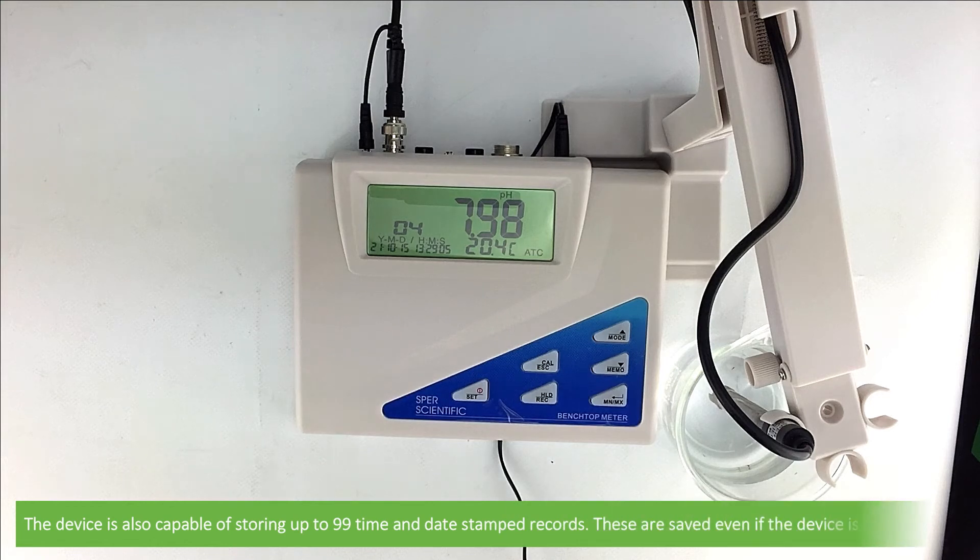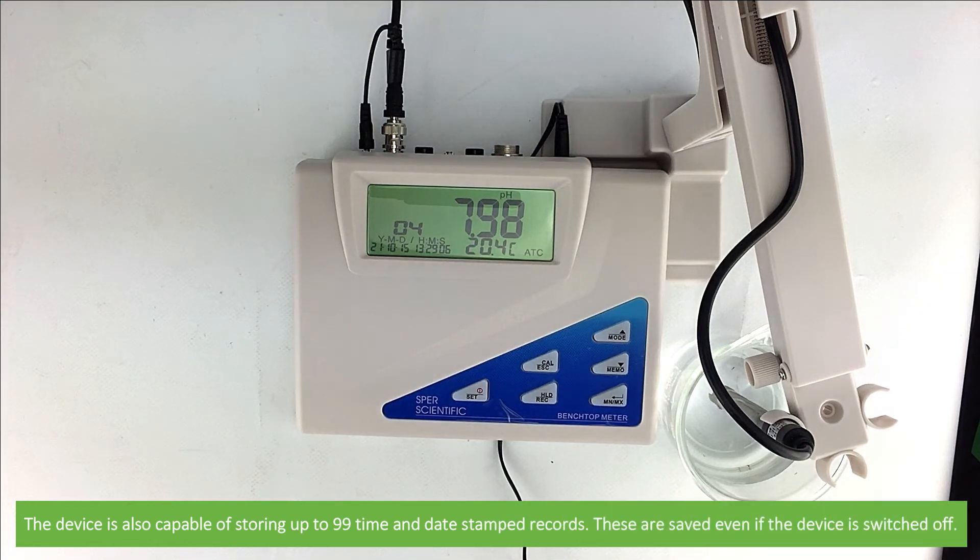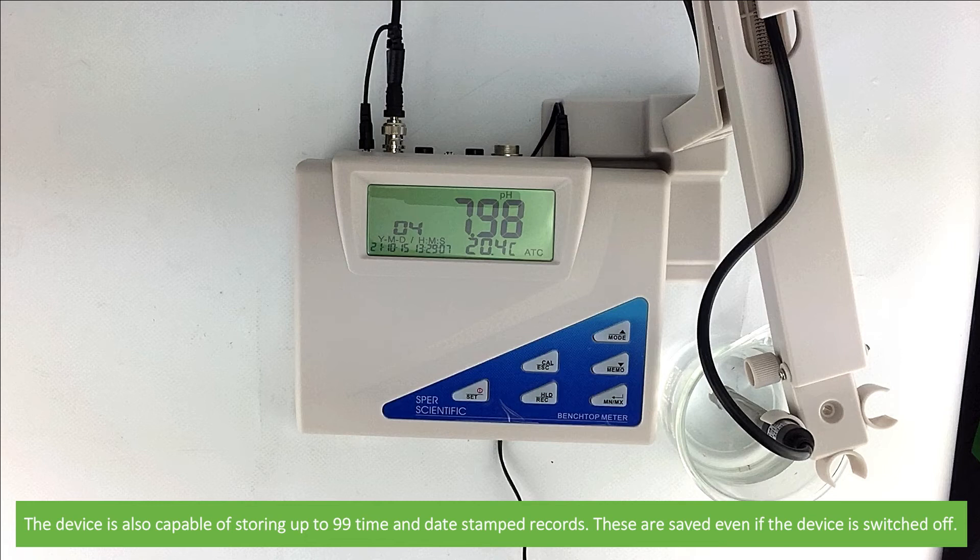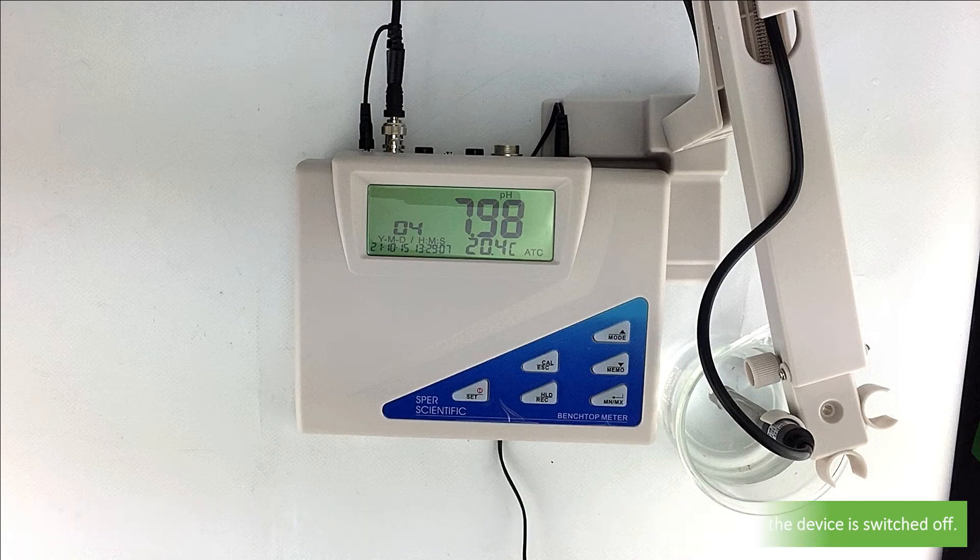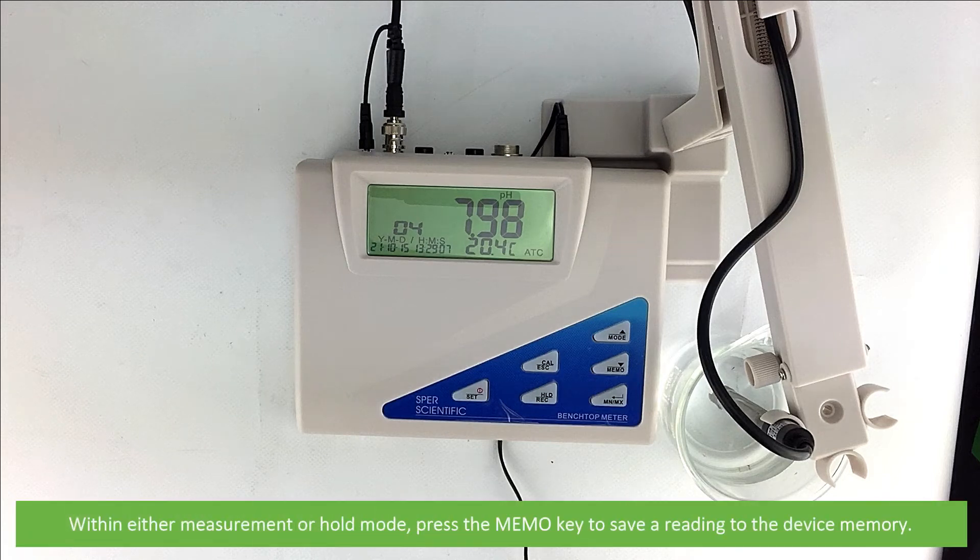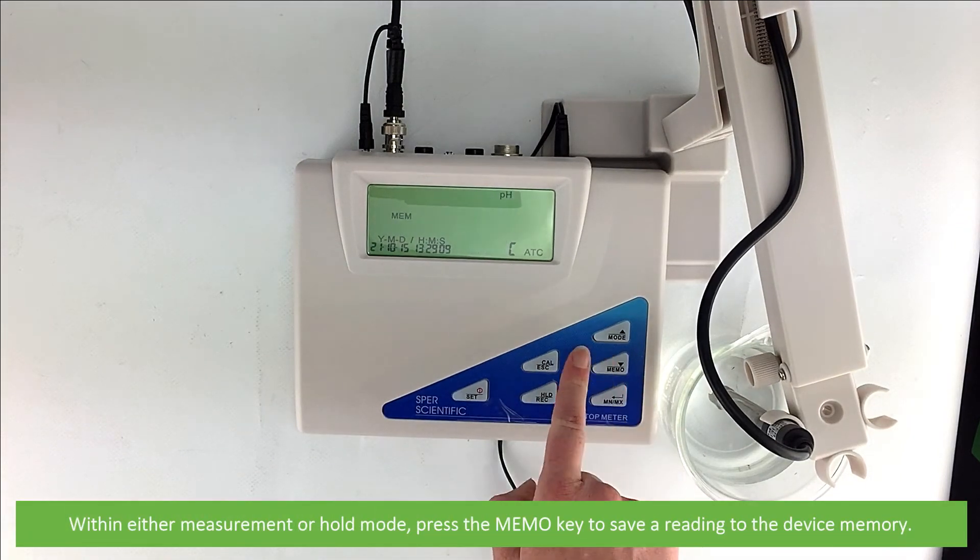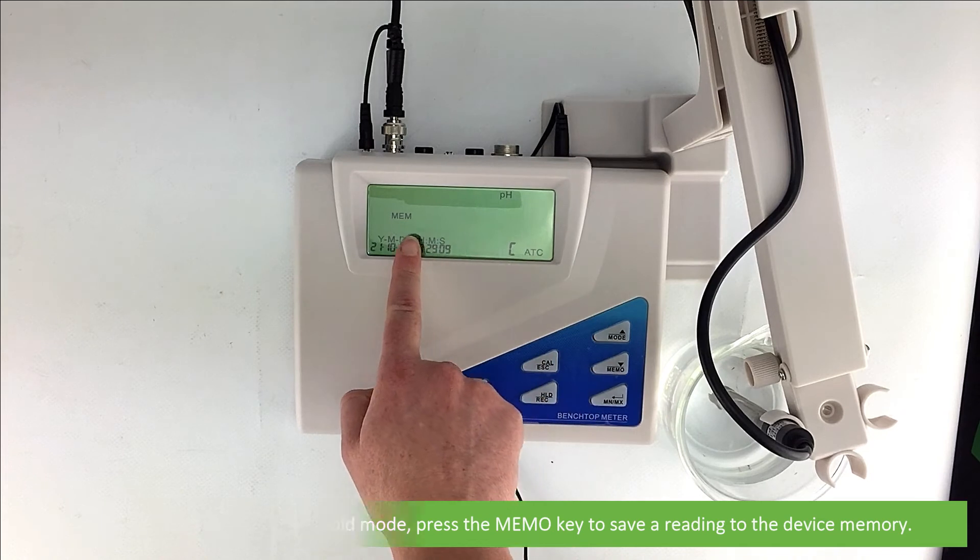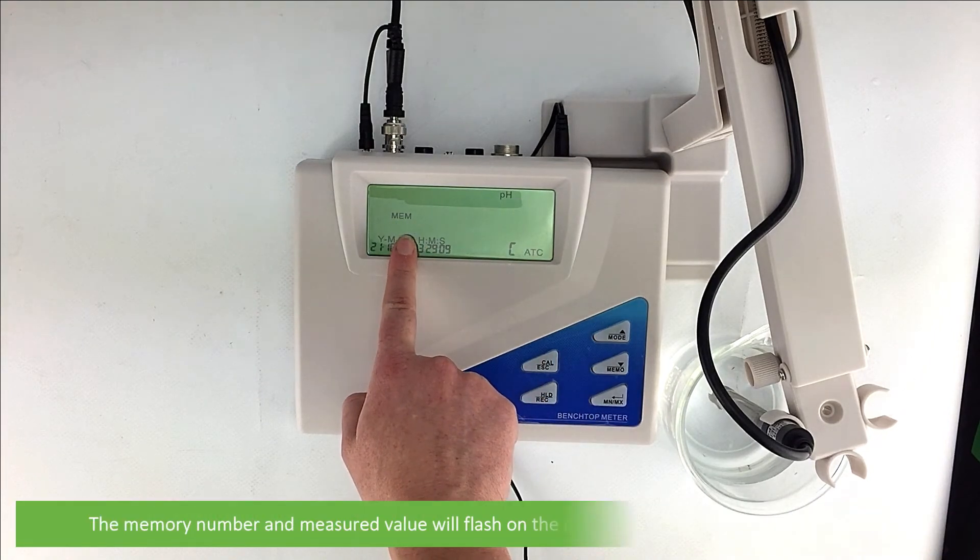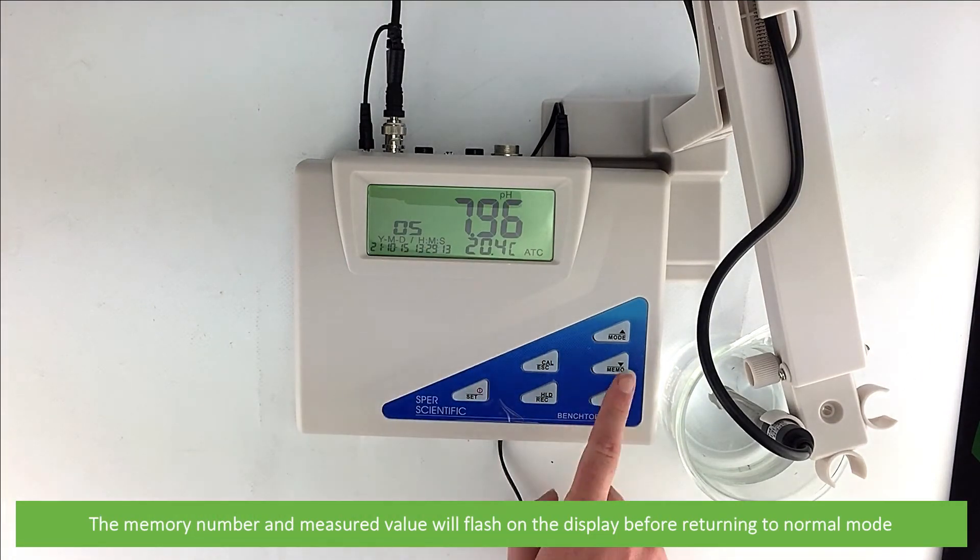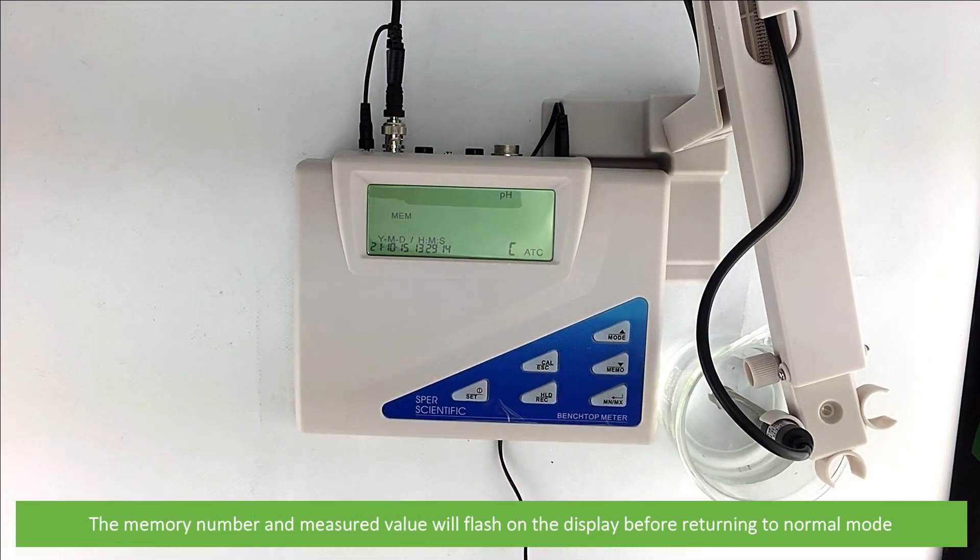The device is also capable of storing up to 99 time and date stamped records. These are saved even if the device is switched off. Within either measurement or hold mode, press the memo key to save a reading to the device memory. The memory number and measured value will flash on the display before returning to normal mode.